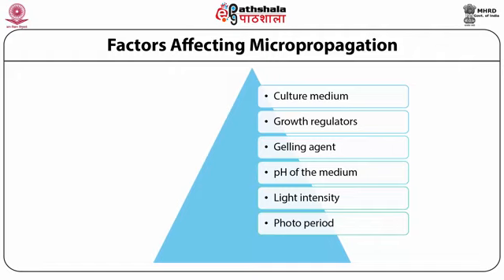In most tissue culture labs, an 8 hour day is adequate, but it varies from 8 to 16 hours. And intensity is about 3000 lux. But it may vary from species to species, so that needs to be tested.